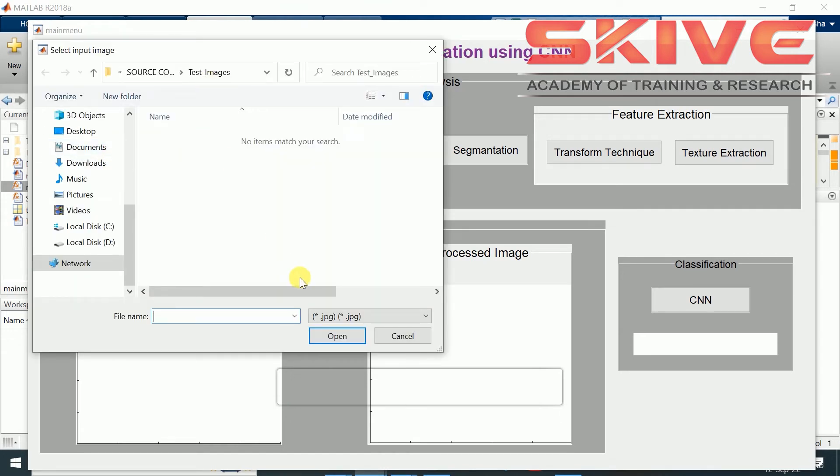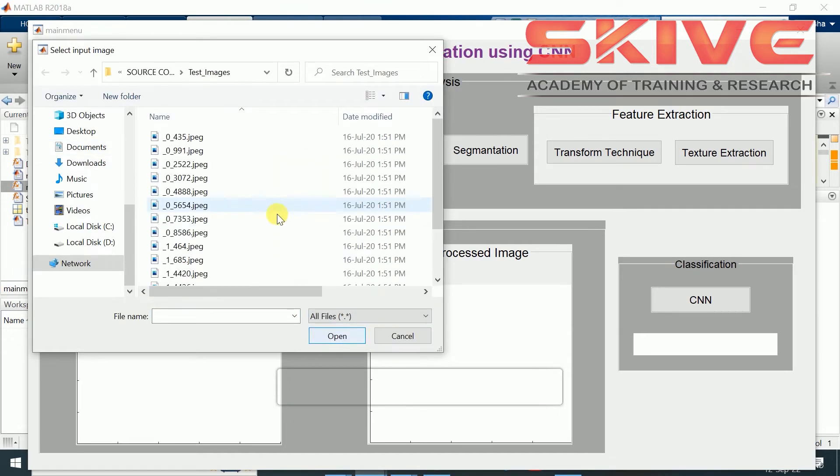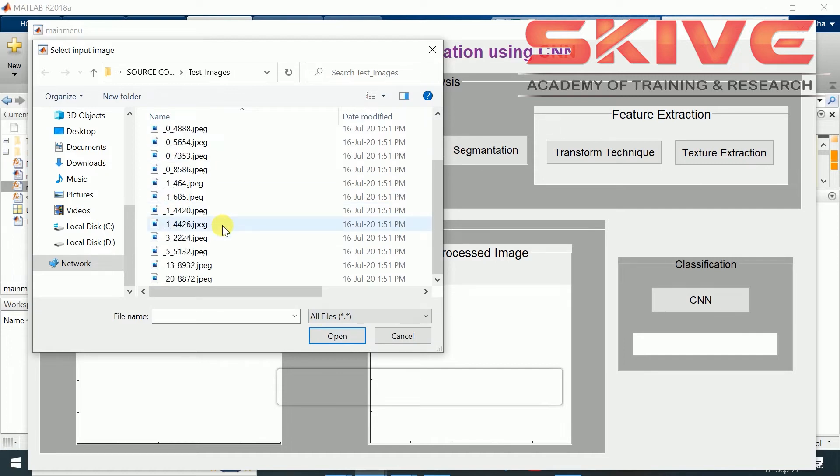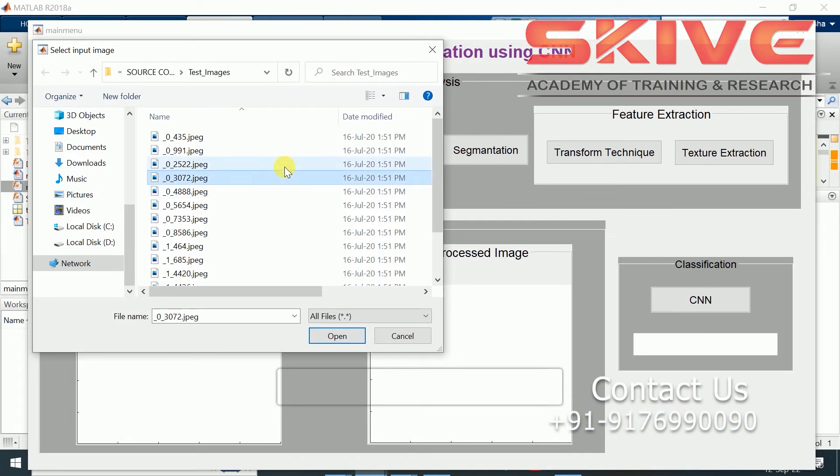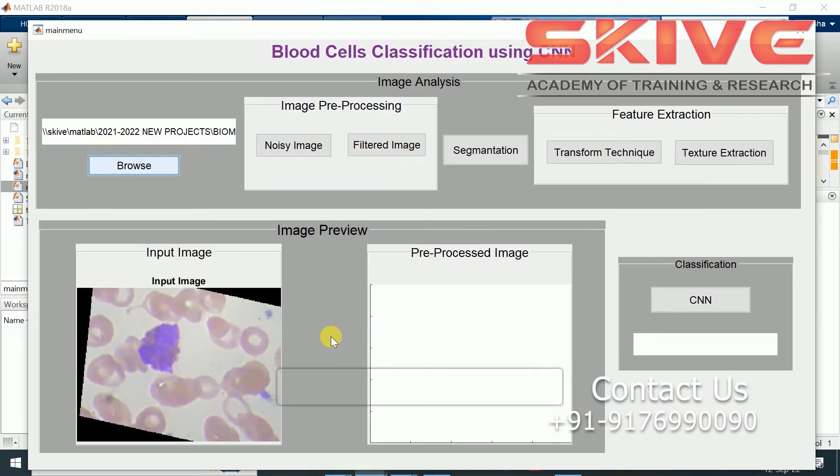First we are selecting the image. Some images will be there. The input image is shown here.